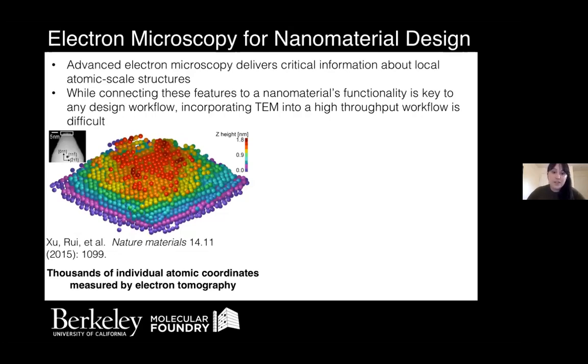And this information and way of parameterizing our electron tomography data by simply being able to extract XYZ coordinates is then something that we can connect to first principles calculations, which is a wonderful and beautiful example of being able to connect our observation in the microscope to a metric for functionality.